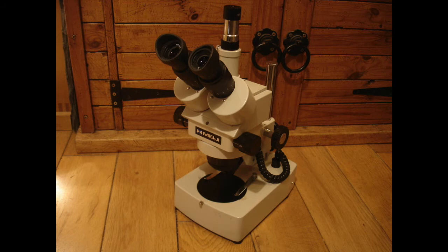I got this one on eBay — it was listed as being unable to focus. I thought I'd risk it because I've bought another microscope in the past that I was able to clean all the lenses inside and make it focus. I paid three hundred pounds for it and was prepared to clean everything. When it arrived, I noticed the bit at the back where it slides up and down just wasn't set right. I literally just had to undo a screw, lift it up, reset it, and it focused perfectly. The guy before obviously didn't know what he was doing — absolute bargain, brand new apart from that.